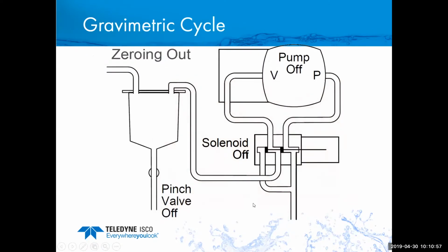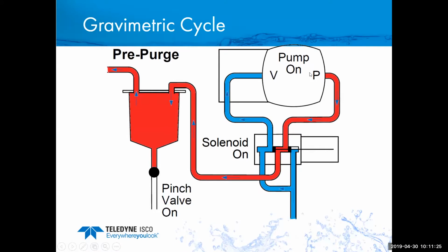So the very first thing it does when it tries to take a sample with the QLS version or the gravimetric fusion version, it takes a chamber weight. It zeroes out the weight. It actually sees what it is. Sometimes you have residue or particles will stick in there, so the sample chamber may change weight between different samples. So it zeroes it out every single time, so you get a good starting point. After it zeroes it out, then it does the same as all the other ones.